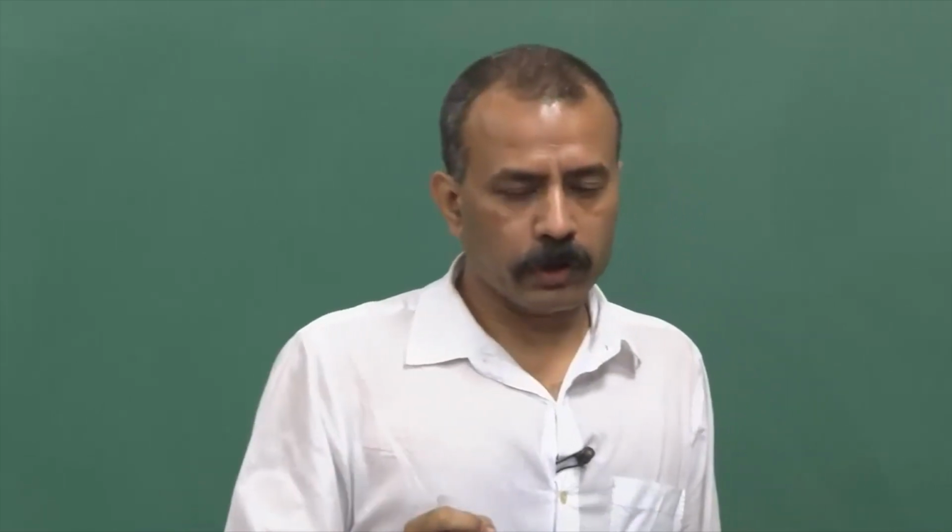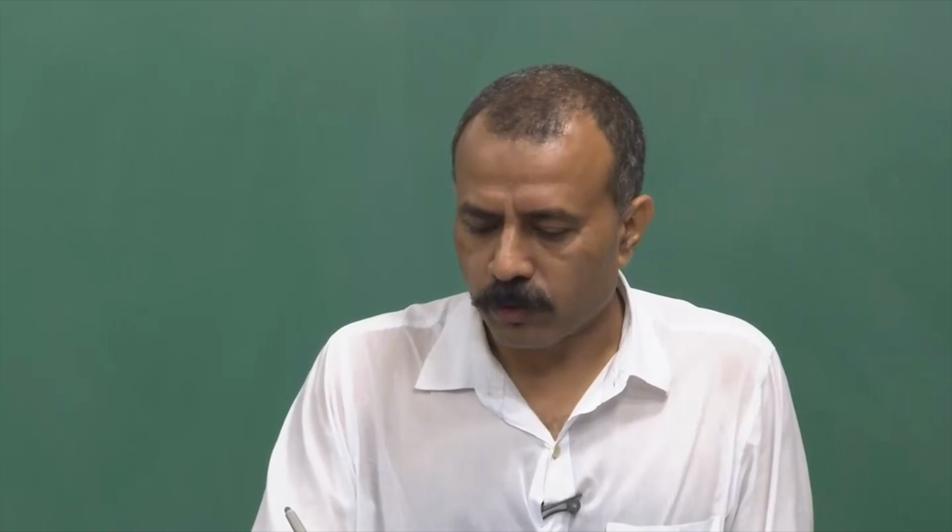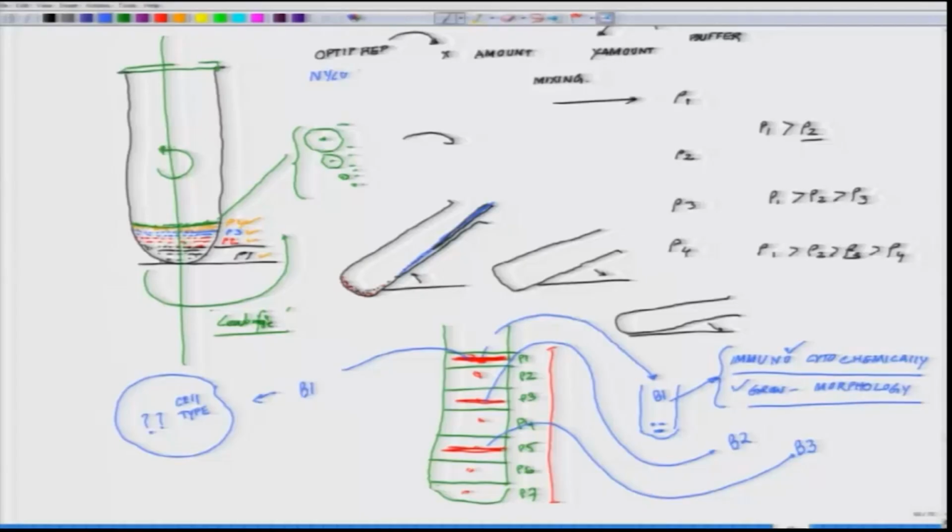Earlier, for embryonic neurons with this particular technique, there was another such thing which is called Nycodenz. You won't find that anymore because they have discontinued this product. It is very similar to OptiPrep: Nycodenz, OptiPrep, sucrose.